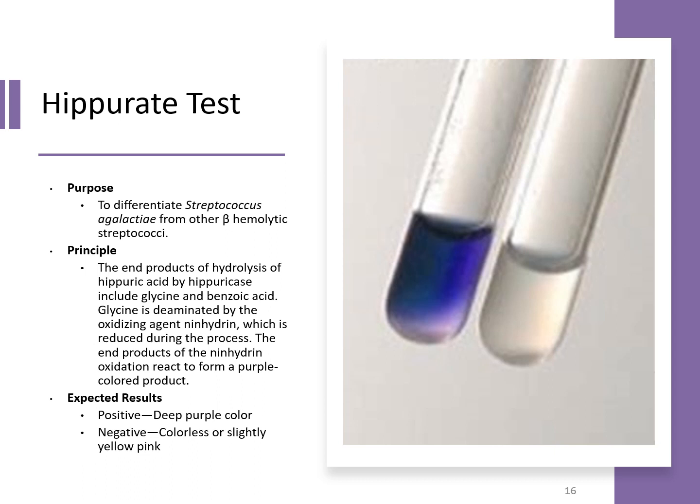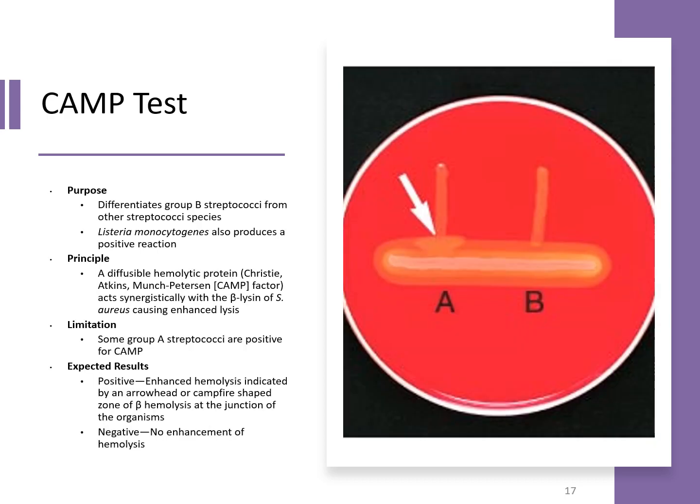For our hippurate test, we're looking for that deep purple color to be a positive, and then no color or a slightly yellow tinge would be negative.